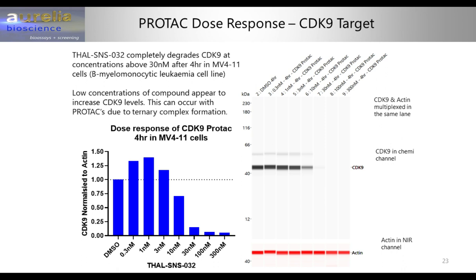Yeah, great, thanks, Carsten. I think we would second that. When we're doing a PROTAC, we typically would use 6 well plates and maybe put between 500,000 and 1 million cells in the well. And then we tend to lyse that in maybe 100 microliters of our cell lysis buffer. But you only really utilize at best like 3 microliters of that in each lane. But then you might have to dilute your protein up to 10-fold in order to do that.